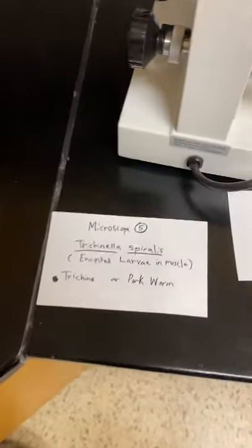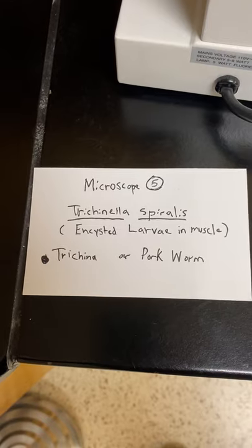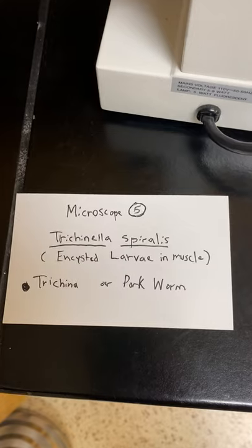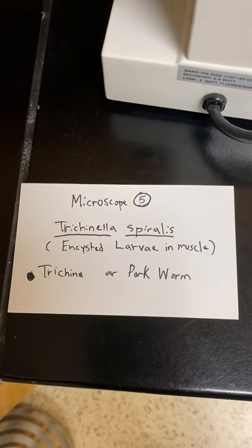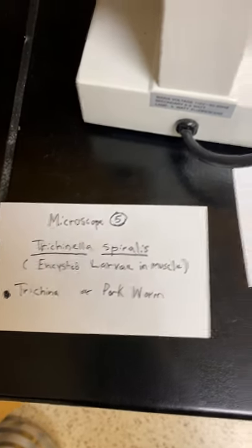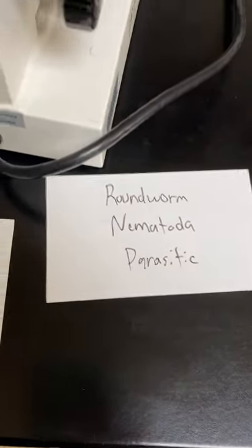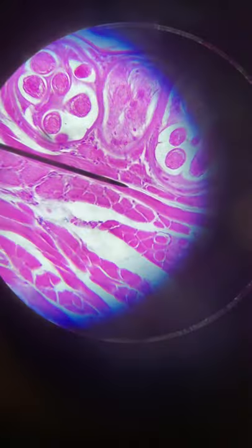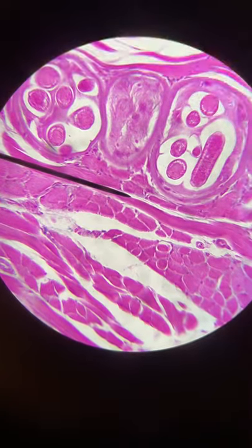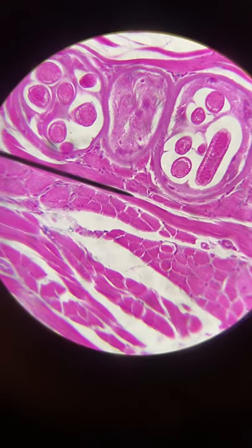Microscope five: this is the trichina, or the pork worm. This slide has muscle tissue — these form encapsulated cysts with a larva inside the muscle tissue of animals. It's a roundworm, Nematoda, and parasitic. You can see those circles — that's the larva inside the encapsulated cysts.